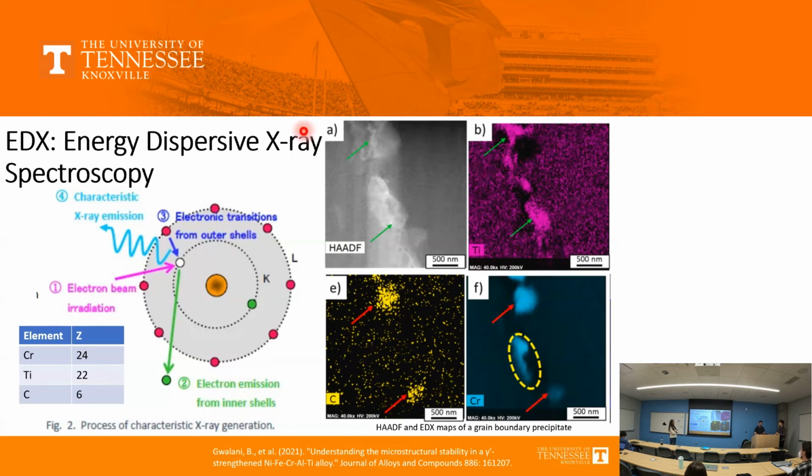One thing to note is that, like many X-ray techniques, this breaks down with very low Z elements. Depending on your system, below boron or lithium it tends not to get anything, or certainly can't be trusted, non-quantitative. Why is that? I taught you in the last class. There's simply not enough electrons. That's basically it. So light, nothing's happening.